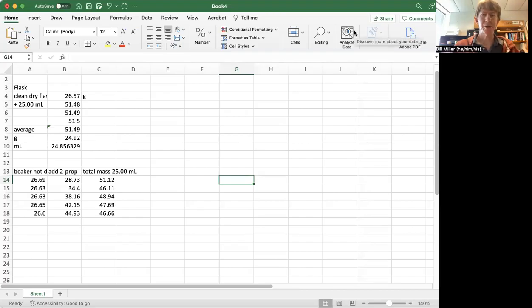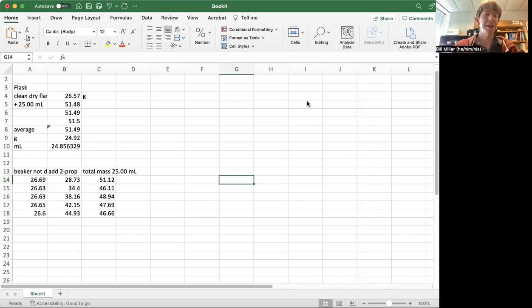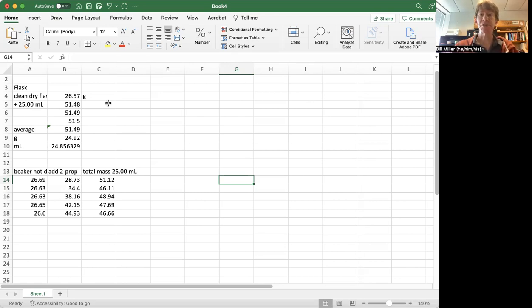This video is going to talk about how to take data using the volumetric flasks, 25-milliliter volumetric flasks, and collecting data for solutions of 2-propanol and water.